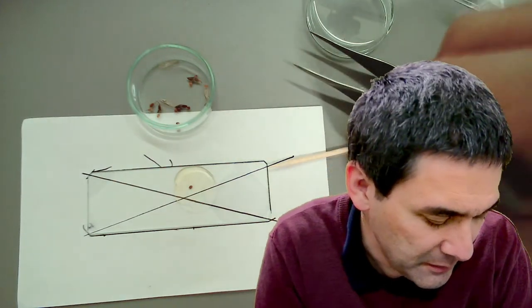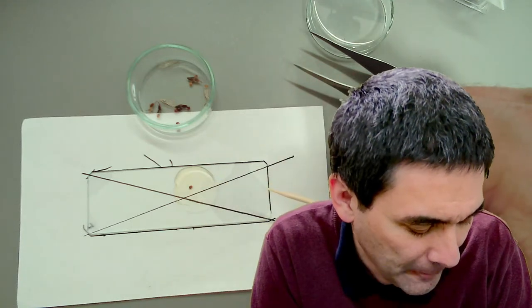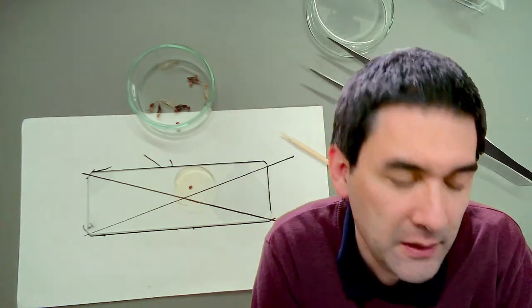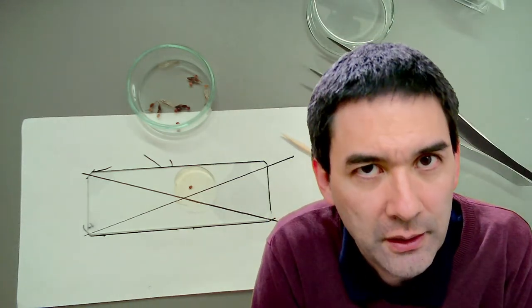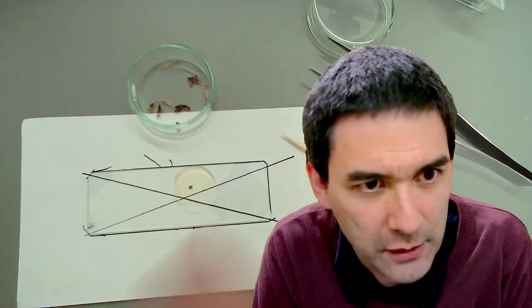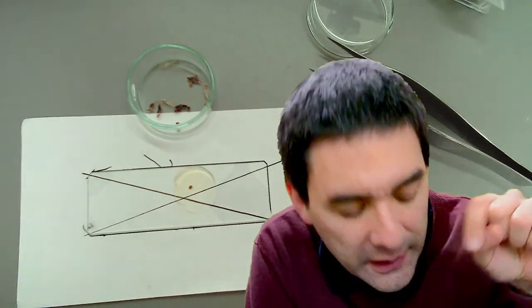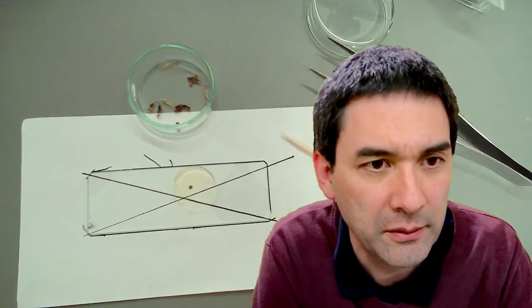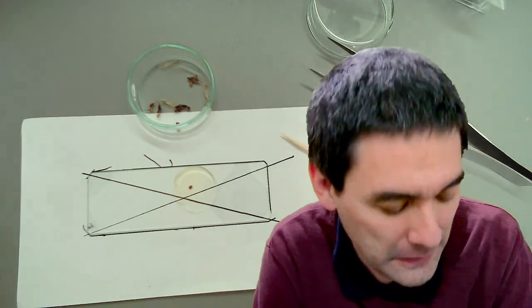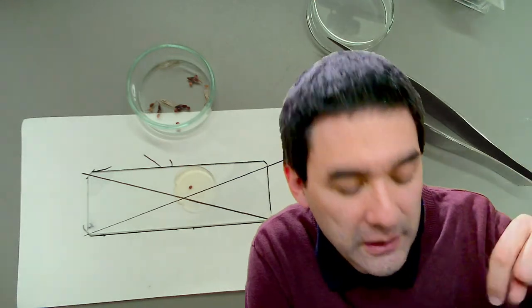The thing is sometimes I will later try to remove or scratch away any excess. But you have to store it horizontally. And there's one tip that I'm giving you. Even if you're impatient, don't look at this right now, because there's the danger of you rotating the objective into the mounting medium which was spilled, okay? So that's a little bit the danger. I'm talking from experience. I have done this myself, okay? I was a little bit careless and then all of a sudden I rotated the objective into the mounting medium.